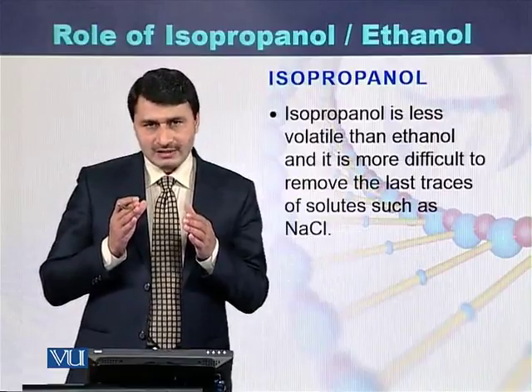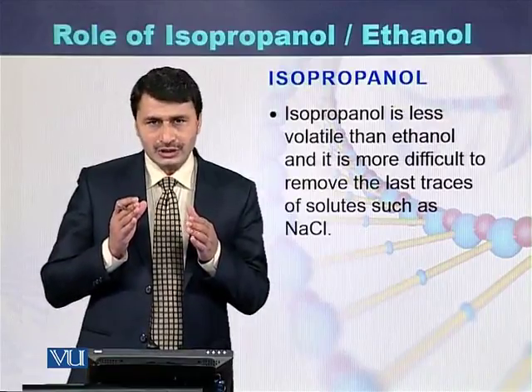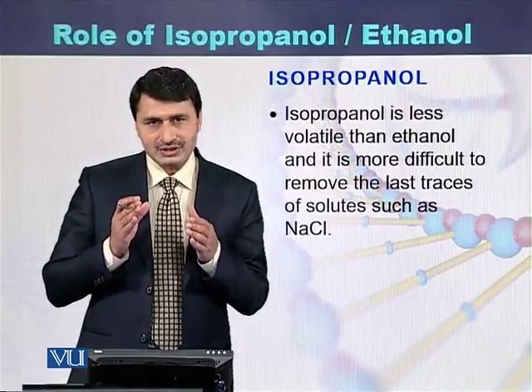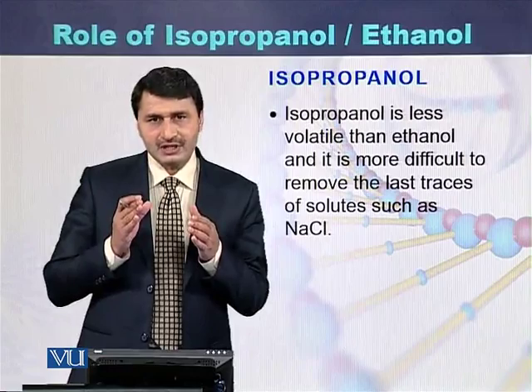Isopropanol is less volatile as compared to ethanol. If isopropanol is used, the last traces of the solutes are difficult to remove.